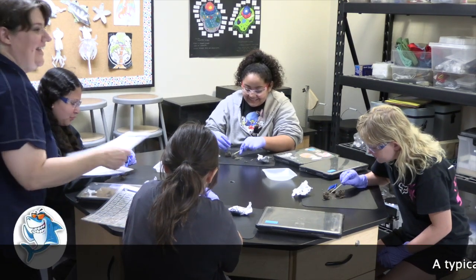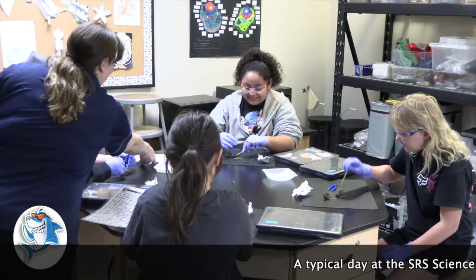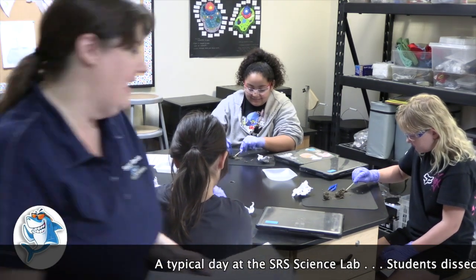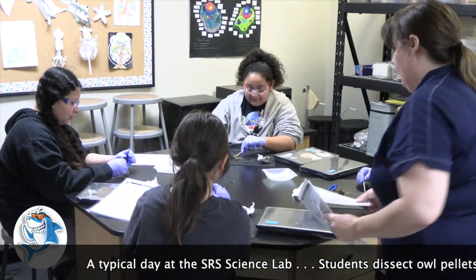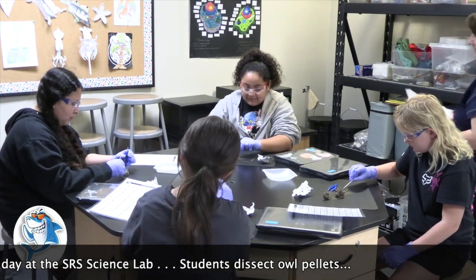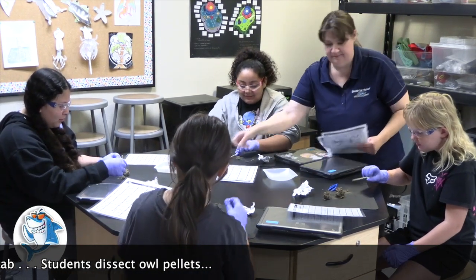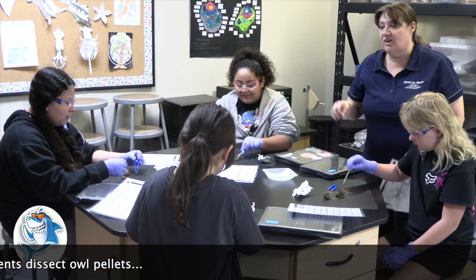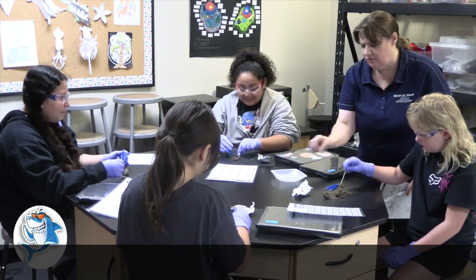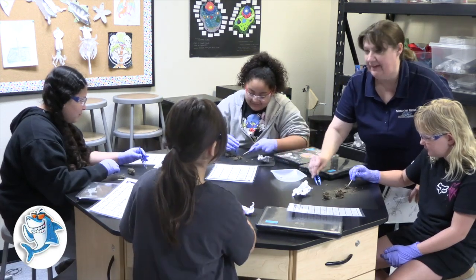So again, you'll have lots of things to write about in your reflection. I can just hear all of you. So what I'm giving you now is a little bone chart, so that as we begin to find those bones, you can maybe start to match them up to figure out what kind of animal. Okay, great. That is probably one of the leg bones. Start to separate the fur, really get in there because there might be some hidden bone. Just the globs of fur separate from your bones.